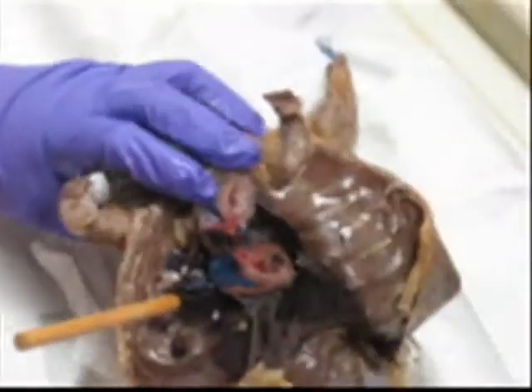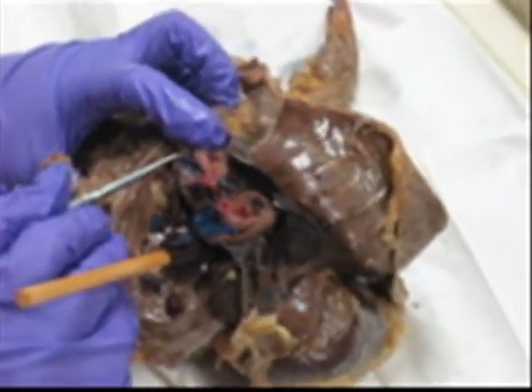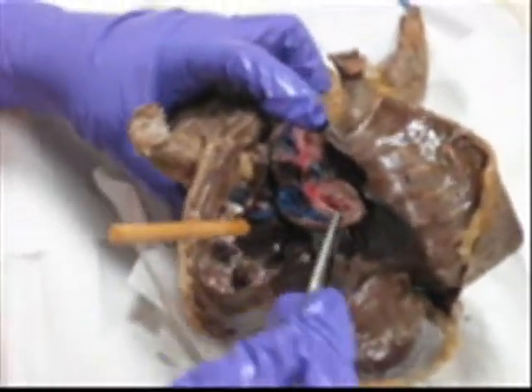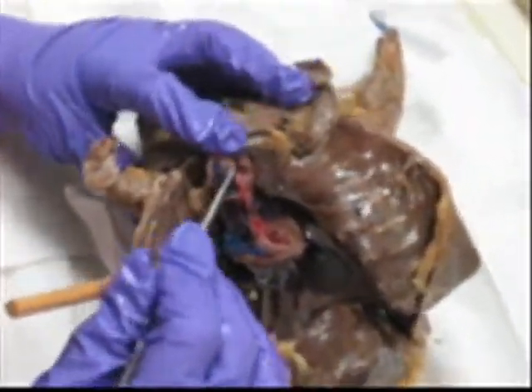Over here, right ventricle. And over here, right ventricle. Over here, left ventricle. And over here, left ventricle — because it flips over. So you're looking at left ventricle here.